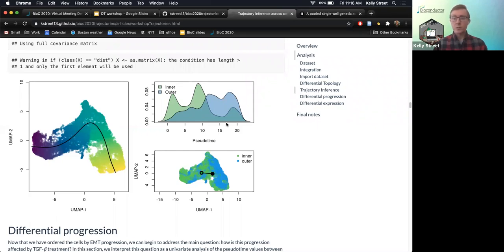And so we've already covered a lot. I think this was one of the places where we wanted to take a break and see if anybody had any questions from the polls. Yeah, there's a few people already asking questions about later steps, and I suggest we do those when we're at those respective steps.